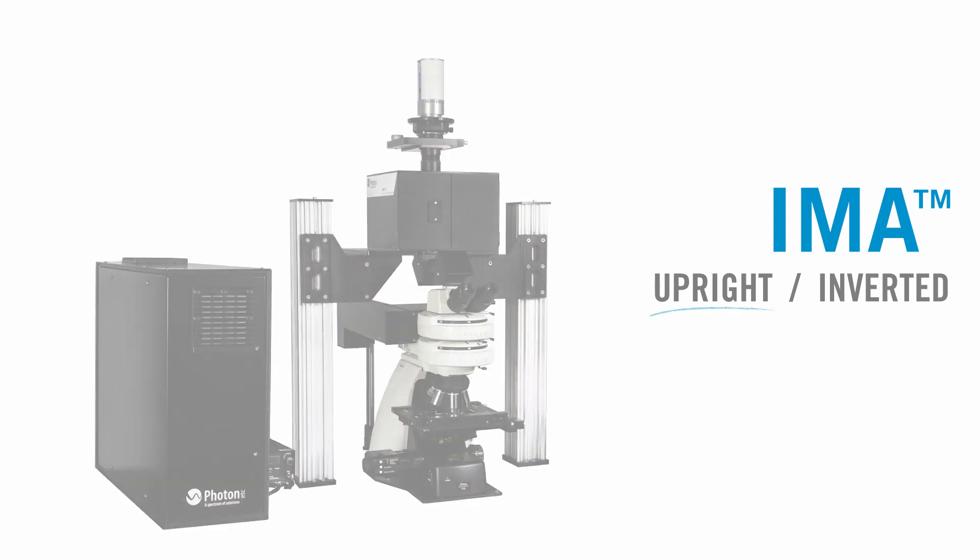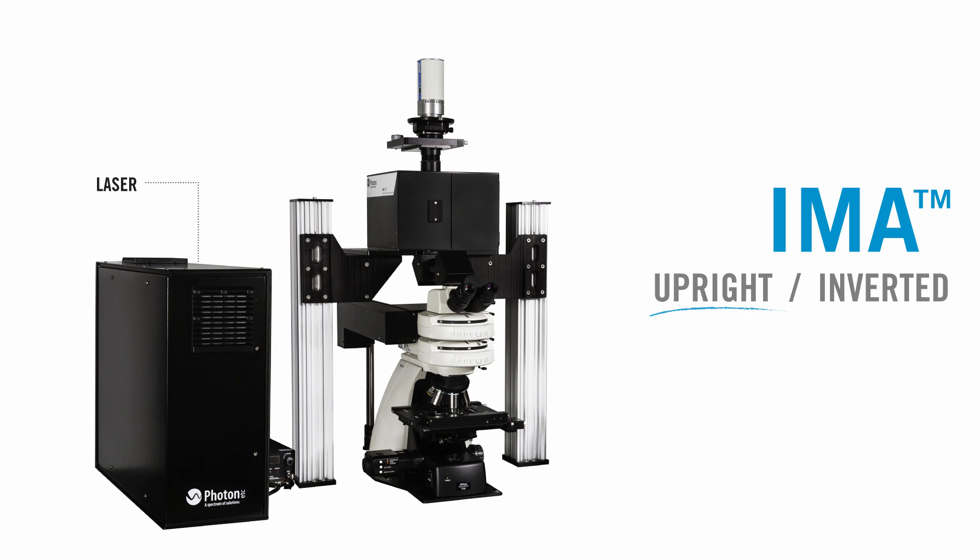It can be configured with an upright or an inverted microscope. In the upright configuration, the laser and beam shaping module ensure uniform illumination over the entire field of view. The hypercube contains the Bragg gratings and filters the incoming signal from the sample. It is located on top of the microscope and is connected to the camera — either a CCD camera, InGaAs camera, or both.